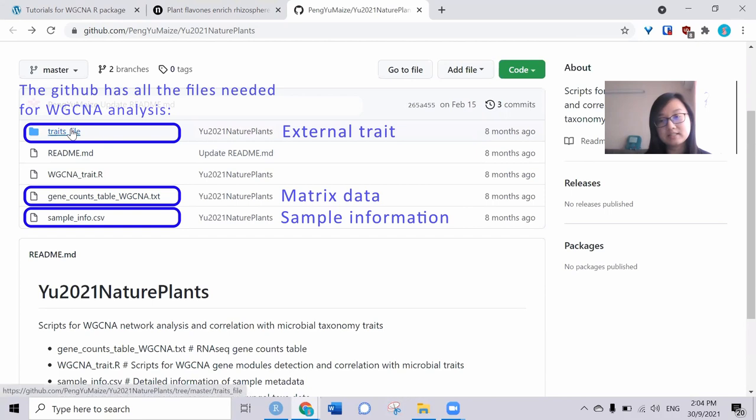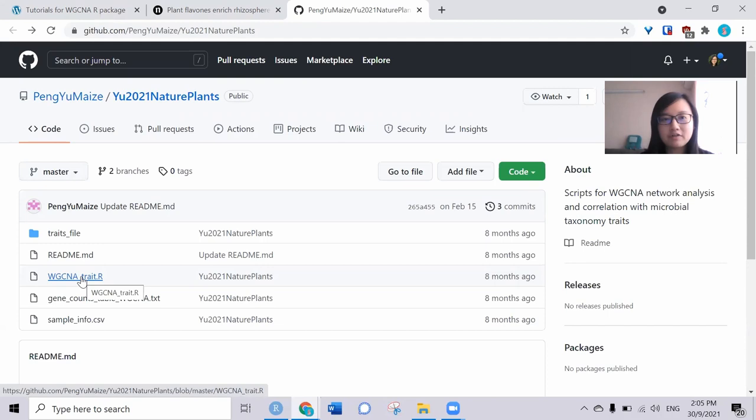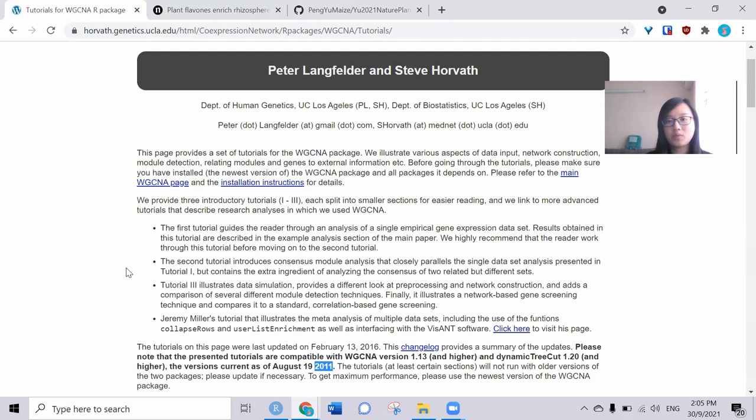This paper mainly wants to find the plant-flavonoid production that correlates with the microbiome in a way to improve maize production under nitrogen deprivation. In my video, I will adapt the R script and also edit some of the elements provided from the original tutorial.